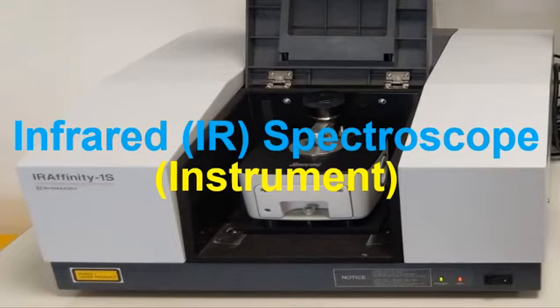So this instrument basically gives us information about the unknown functional groups that exist in a chemical material, either in a molecular form or in a chemical compound form.